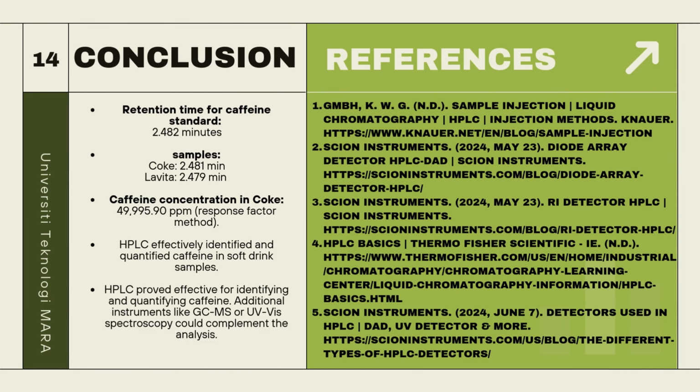As for the conclusion, the study successfully determined the retention time of the caffeine standard, which was measured as 2.482 minutes. This value was used to identify the caffeine peaks in the tested soft drink samples. The retention times for caffeine in Coke was 2.481 minutes and in Lavita 2.479 minutes, closely matching the standard, confirming their identification.